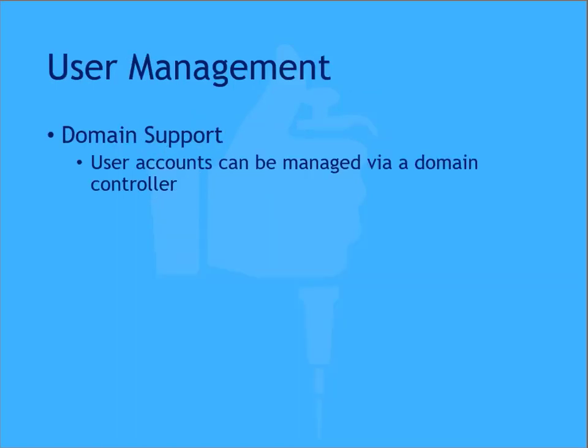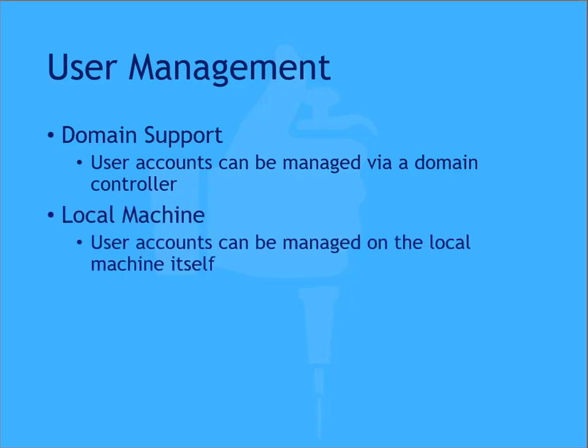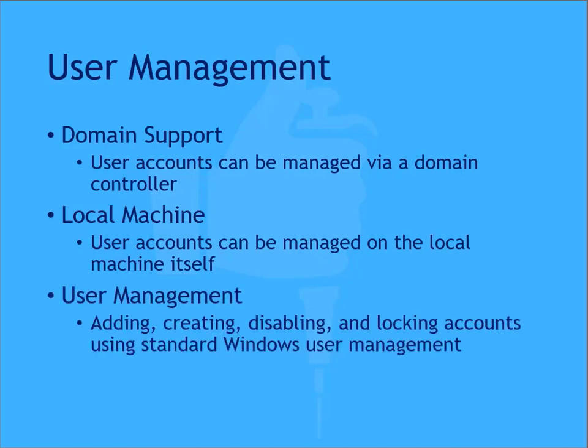The user management feature of MyAssays Desktop Enhanced Security allows individual user accounts to be managed at the domain or at the local level, depending upon your organization's requirements. Standard user management tasks like adding, creating, disabling, and locking accounts, as well as defining password policies, can be administered using the standard Windows user management tools.